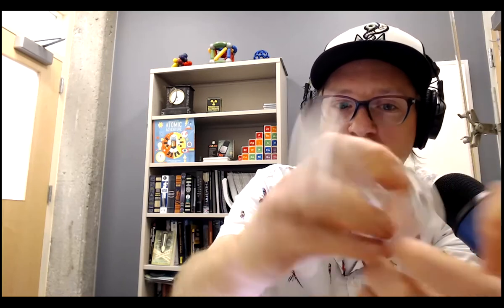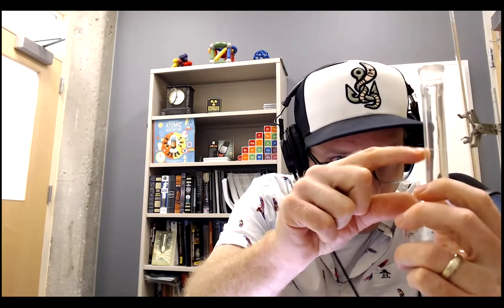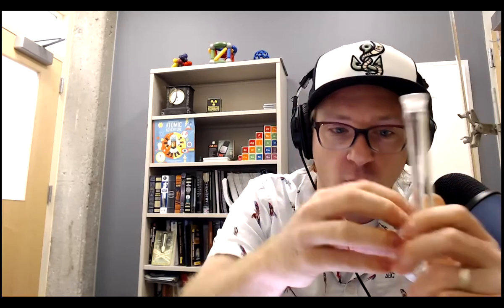You have this like concrete stuck to the bottom and no space to mix it. So just add a little bit, mix it up really good, add a little bit more, mix it up a little bit more. Now it's all dissolved. Now you want to add right to the line, and you might want to use your dropper to fill it in, because if you go above that line, you got to start over. You got to rinse this out.